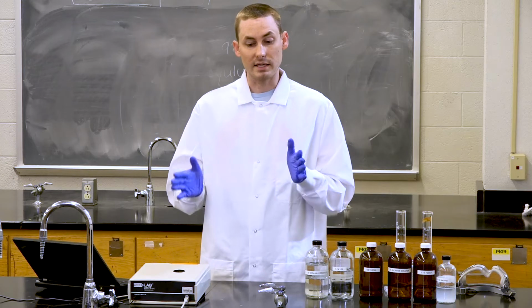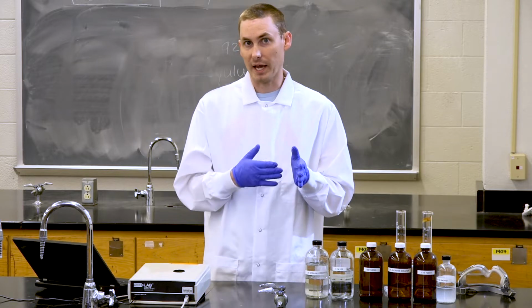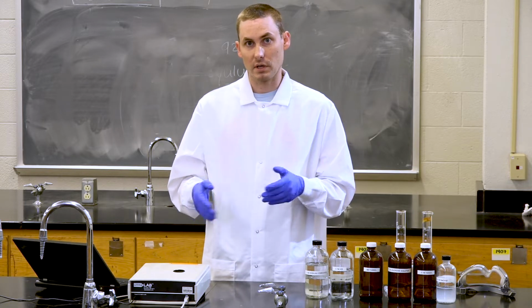So when we have an ionic compound that we put into water and it becomes ionized, we call this an electrolyte. And electrolytes can carry conductivity. That is, they allow electricity to be passed through the solution. Compounds that do not form ions in solution are called non-electrolytes, such as sugar in water. These do not have very high conductance and therefore do not allow electricity to pass easily through water.